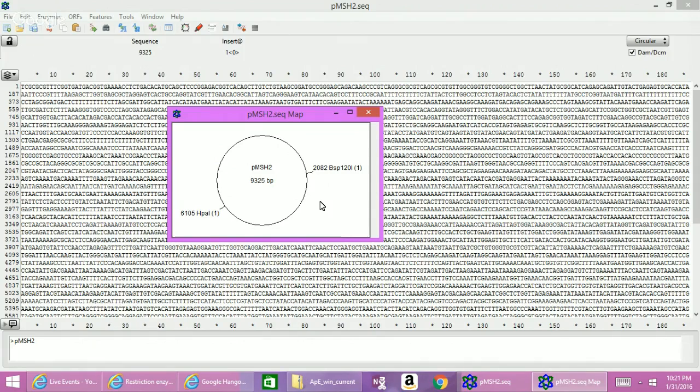I should have 5,302 base pairs remaining once that cut is finished. Now that can be a good number depending on how small or how large you want to cut this particular sequence. But in this video, I'm not worried about that.